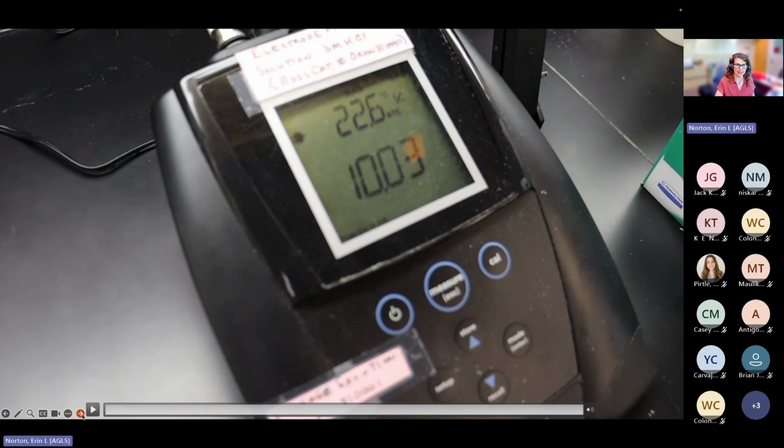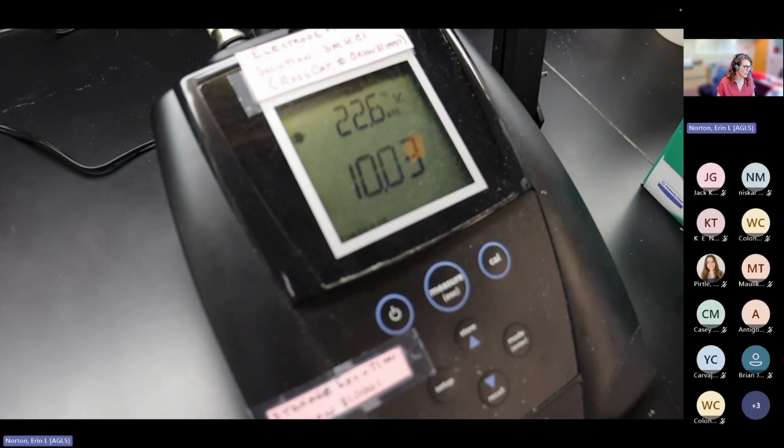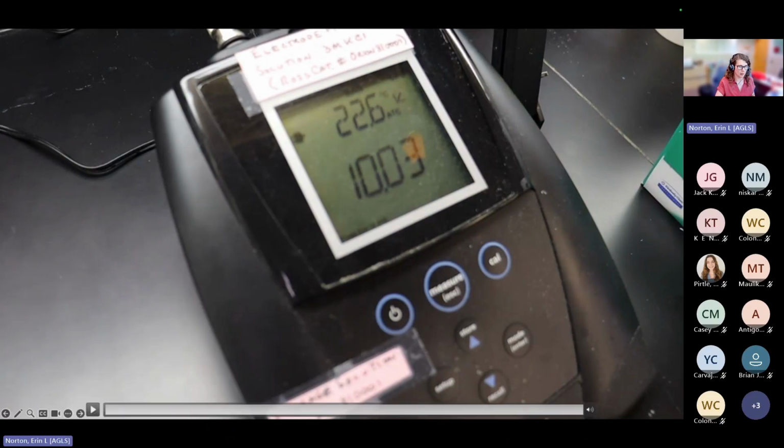Okay, so that is a little bit about the pH meter. Make sure you understand how to use your particular pH meter. Make sure that you are calibrating it regularly. Make sure those calibration solutions are not expired and fresh. And as you can see, we pour out a little amount into a little vial so that it's easier to use. You can use a little beaker as well, but I think we reuse those a couple of times before we refill those vials up.